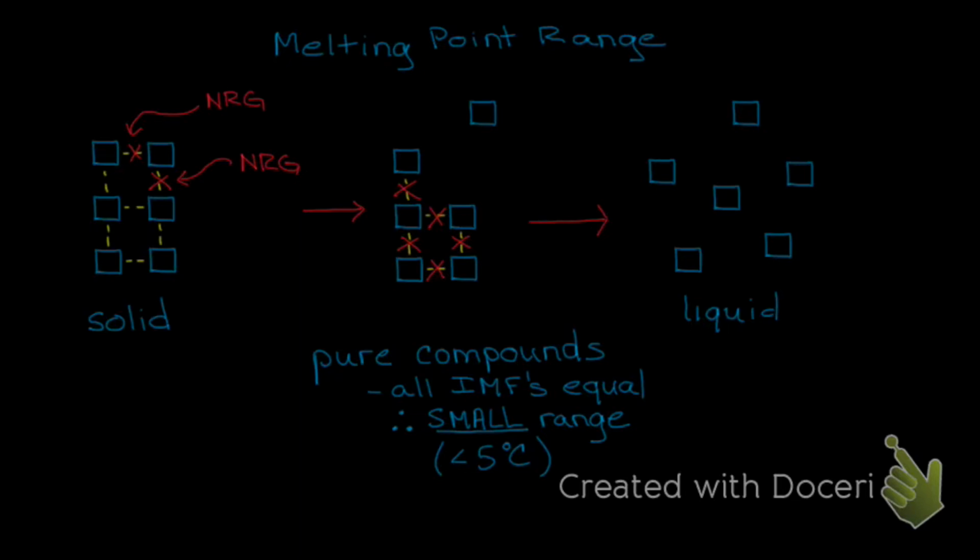You learned in general chemistry that the temperature of the material absolutely does not change as it melts. However, with the techniques that we are using in the lab, that is not completely true. We actually do see a small range when we are melting an absolutely pure compound. But if you look up literature melting point values, they're typically ranges that are somewhere around 2, 3, 4 degrees Celsius, nothing larger than that usually.